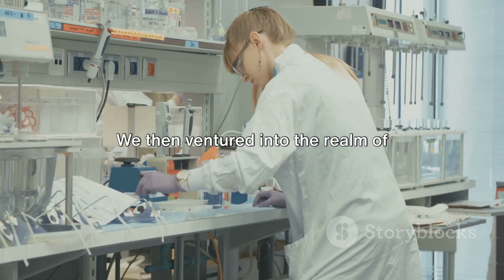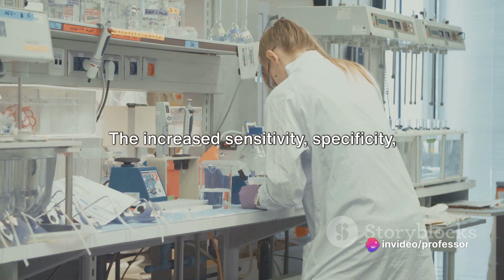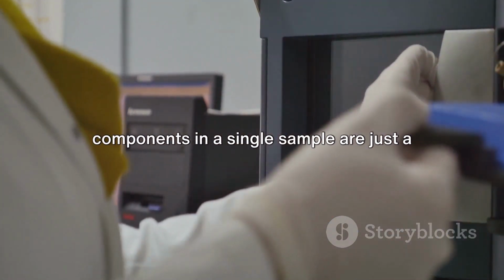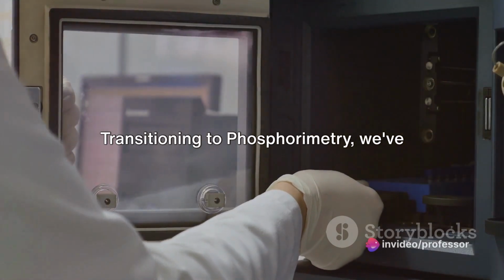We then ventured into the realm of spectrofluorometry, taking note of its substantial advantages. The increased sensitivity, specificity, and the ability to analyze multiple components in a single sample are just a few of the highlights that make it an essential tool in many scientific fields.